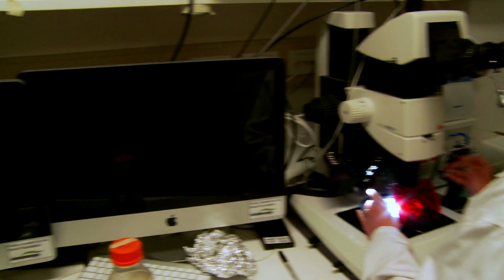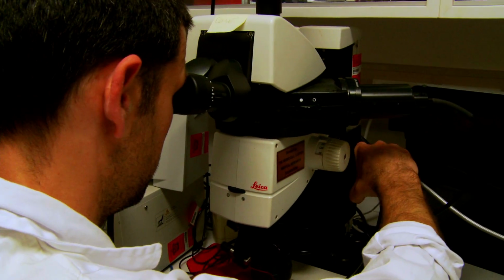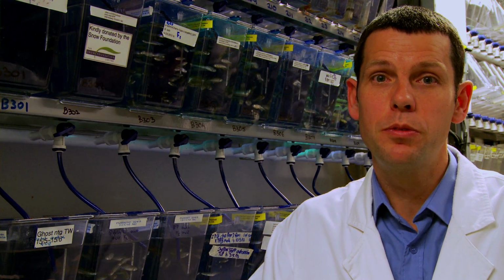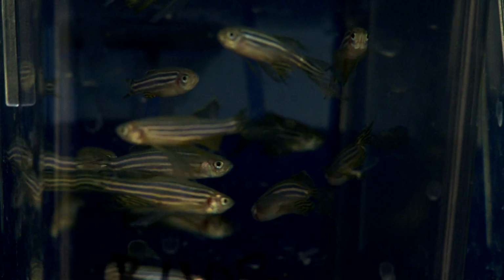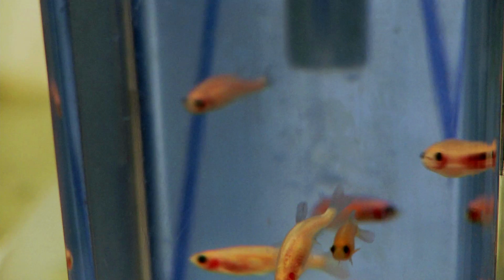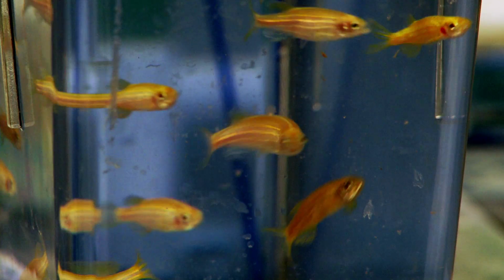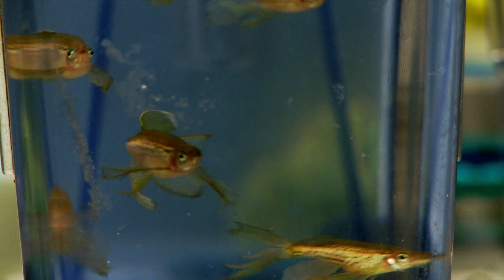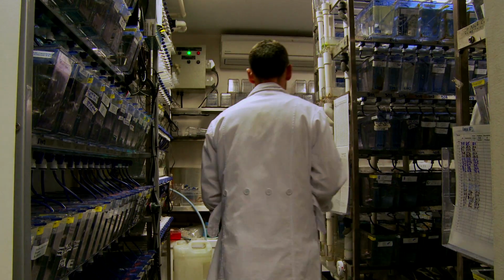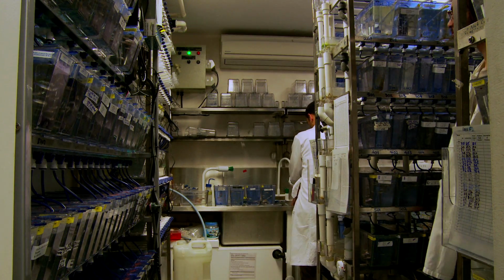In my laboratory we have this fish facility. We have this relatively small room which has these fish racks in it which are full of different types of zebrafish. So each of these tanks contains a separate strain of fish, which is a completely different experiment. This is a really efficient way to use animal models. If you could perhaps imagine this was a facility with mice in it, it would be enormous and require a large number of people to run it. But this is a fairly compact model system which we're able to run relatively cheaply and with very few people, and yet gives us very efficient research outputs.